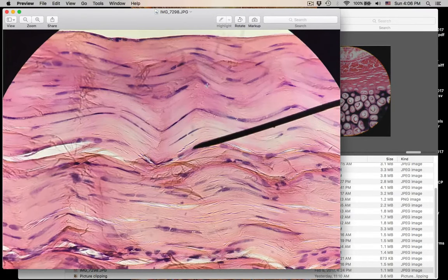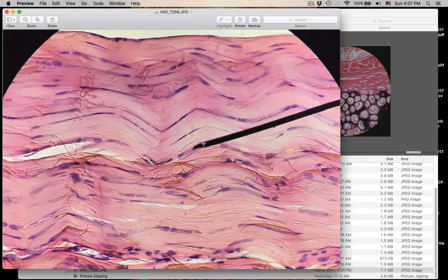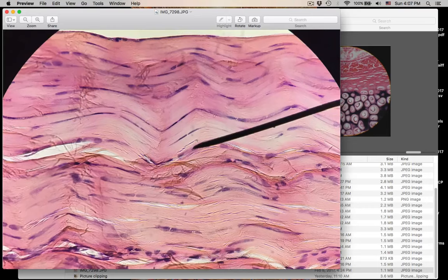Here's a close-up of a connective tissue you've seen. This is number twenty-four. What type of connective tissue is this? What are the name of the protein fibers — most of the protein fibers in the matrix here? And is this considered a dense or loose connective tissue?